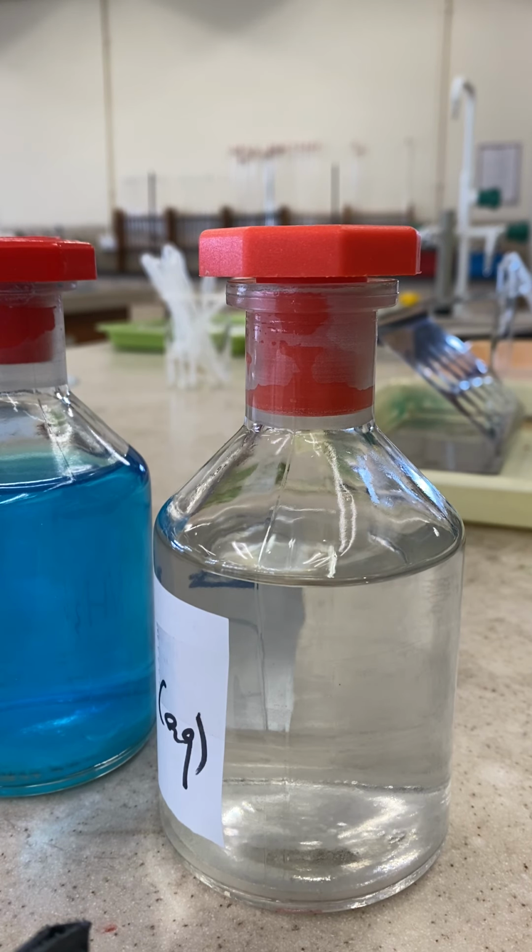So when you're making this observation, nothing new is formed, no reaction happens, and we call that the copper-2 sulfate is blue in color, is a liquid under room temperature and pressure, in the form of a solution. They are the physical properties of copper-2 sulfate.